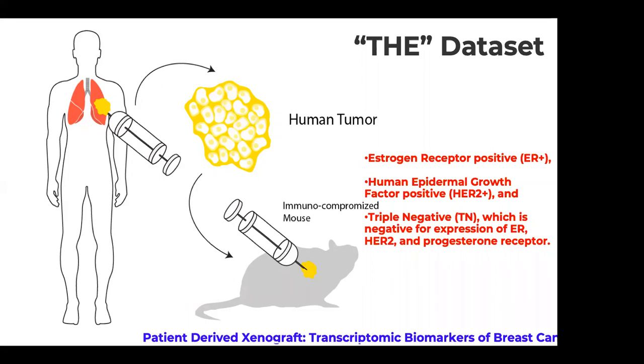So from the full data set, we will only be taking two subtypes of breast cancer in this example, which is ER positive and triple negative. In the full project, which I discussed before, and I'll show you again, there are 7 ER samples and 13 TN samples. Each type of breast cancer has different characteristics, which we will be studying through gene expression. So that is the objective.